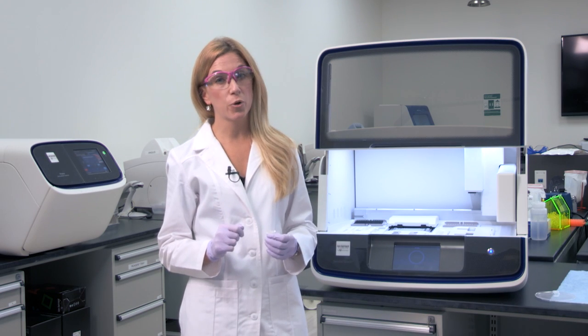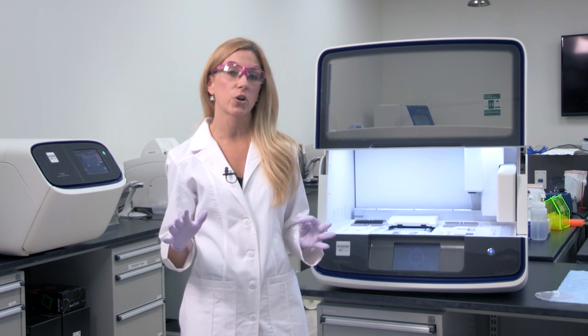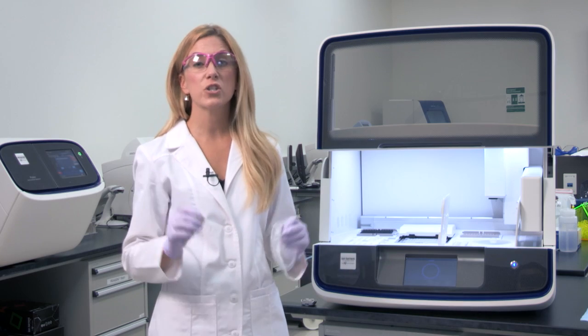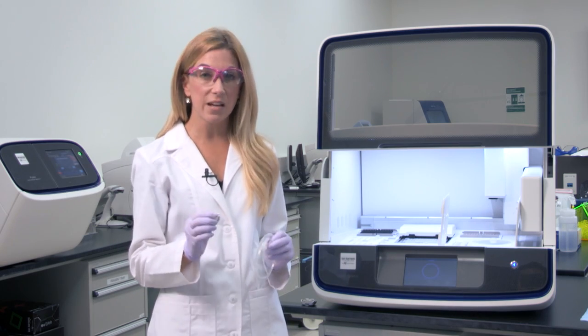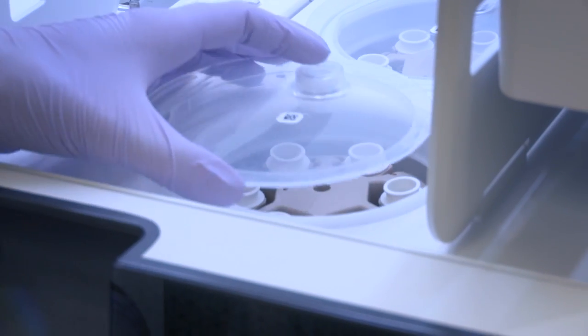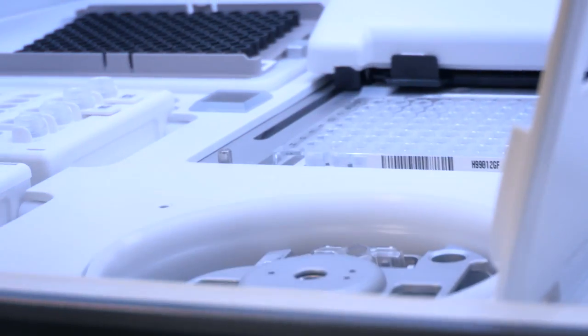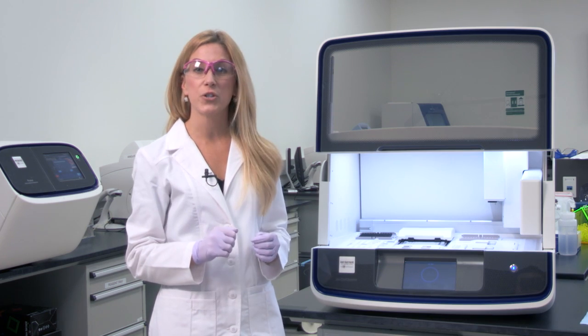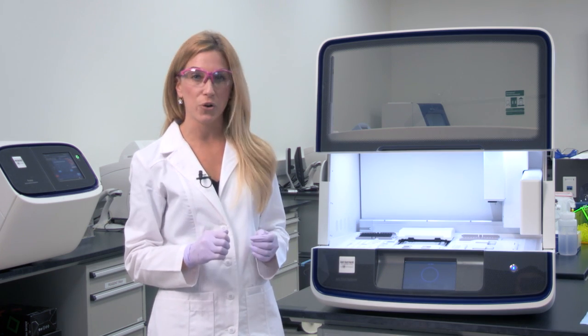Setting up for template preparation and chip loading is really simple, as they both occur in the Ion Chef workflow. First, you're going to want to dilute your library samples and load them into the reagent cartridge. I've set up the Chef almost like I did before, but this time I'm going to include recovery tubes in the recovery station and one or two chips into the chip loading centrifuge. So now your Ion Chef system is ready to do the template prep and chip loading protocols.